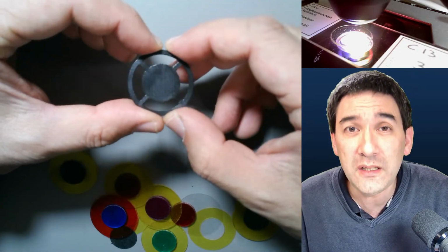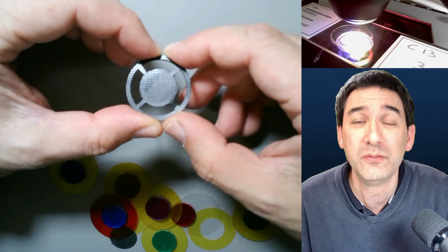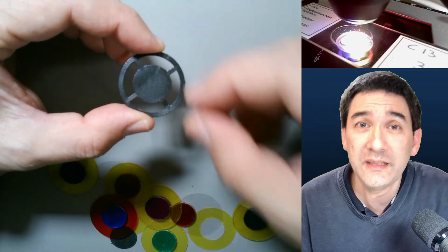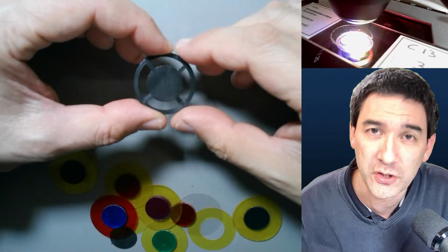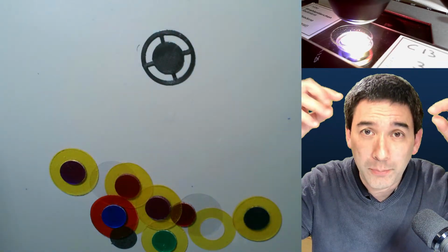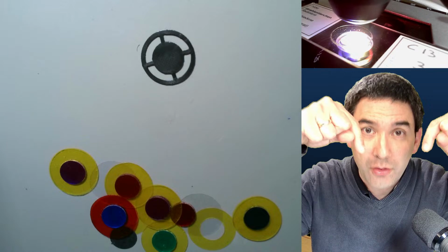But if you need a dark field also at a very high magnification, then you have the option of illuminating the specimen from the top. This is super expensive. You need a special microscope which has a lamp at the top, and the light is redirected down the tube through the objective.